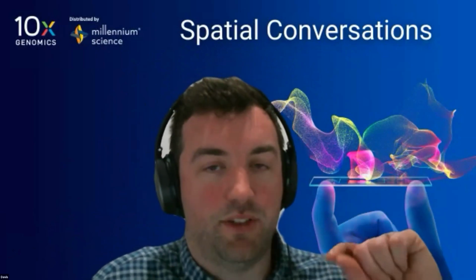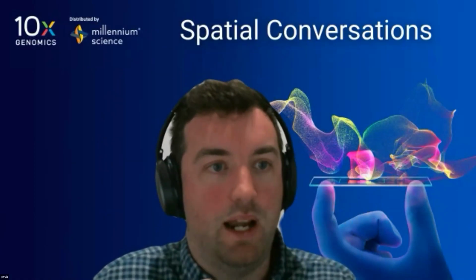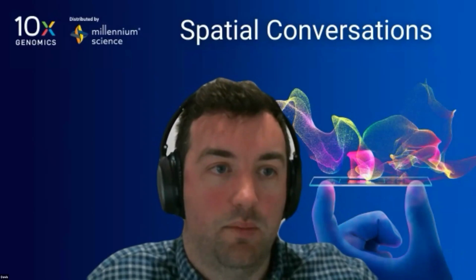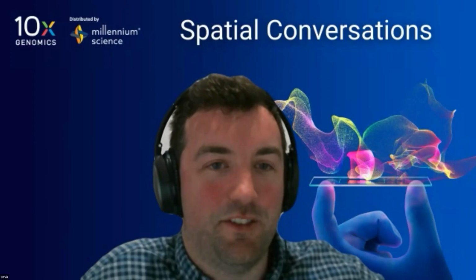Having said that, we've seen GraphSage with colleagues at WEHI work really well in different settings, from brain cancer to other things quite different from the lung, but that's still been with a targeted panel. So if you've got Visium HD data in large volume, then sure, let's have a go.